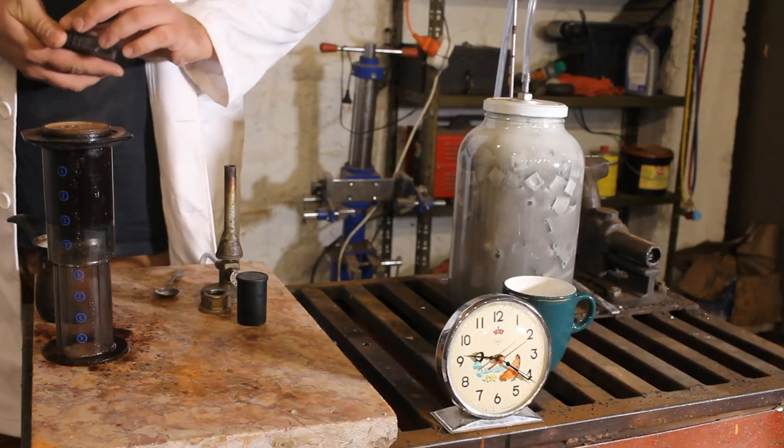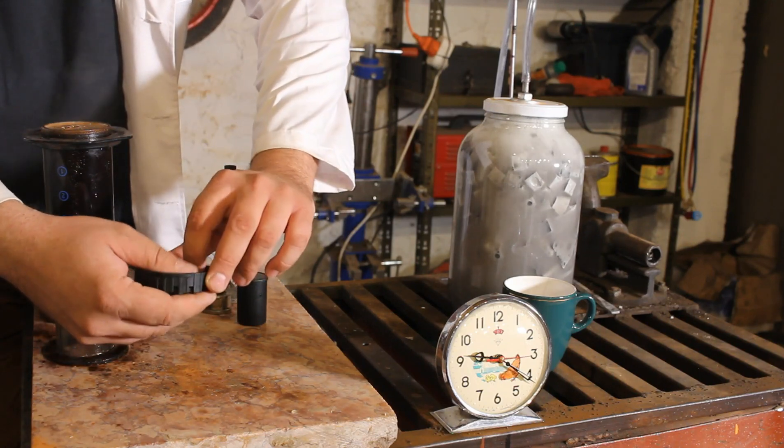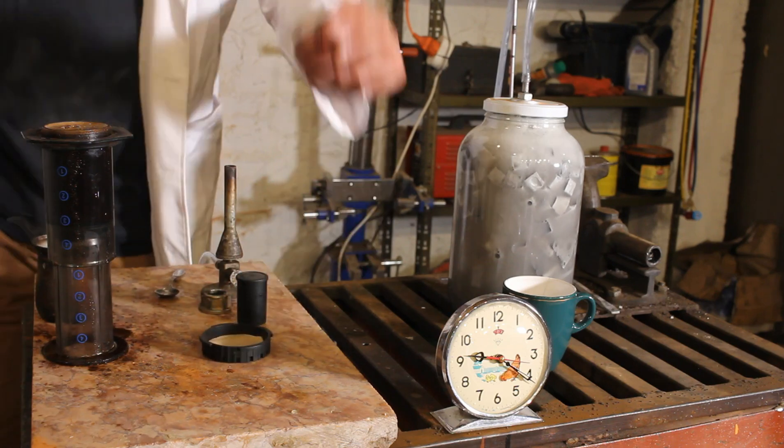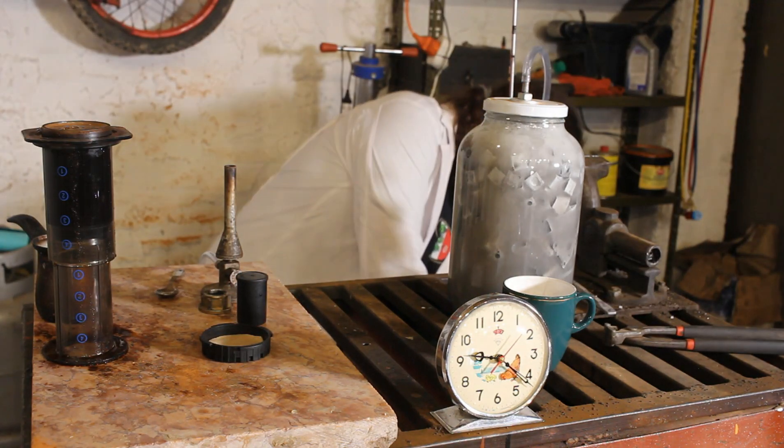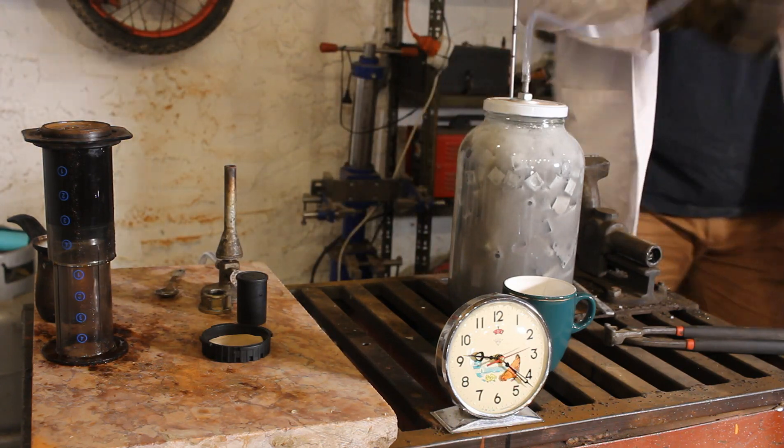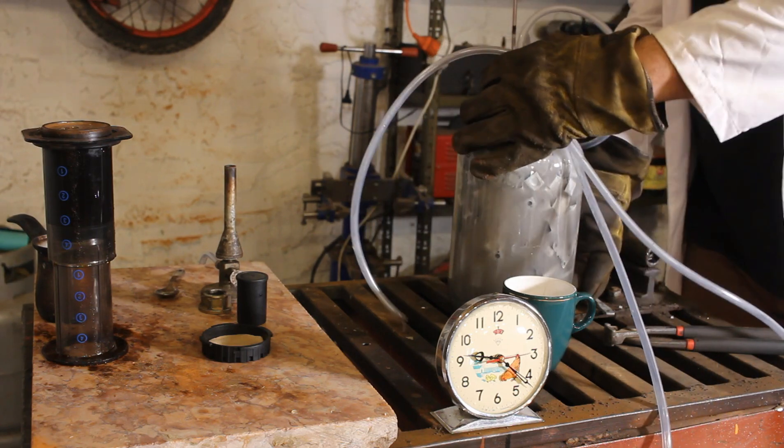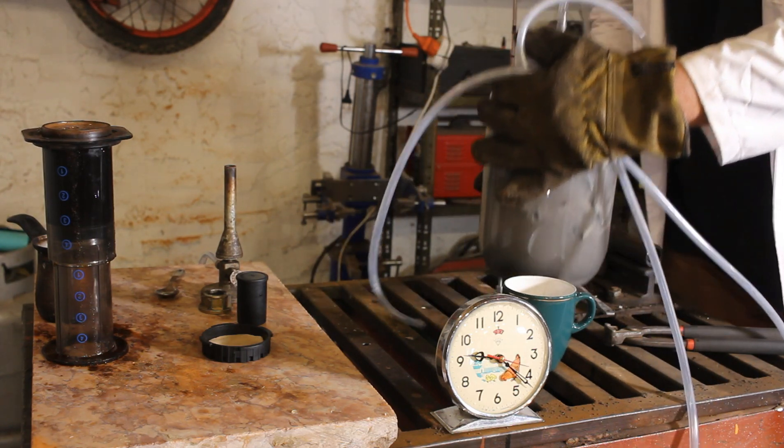Time to put the filter into the filter holder, by the way this filter is homemade as I ran out of original Aeropress ones. As the coffee grounds settle I disconnect the bubbler and I'm gonna take the main jar somewhere safe. There I'm gonna open the top cap and pour all the sodium hydroxide solution into a chemical resistant container, thus stopping the reaction.